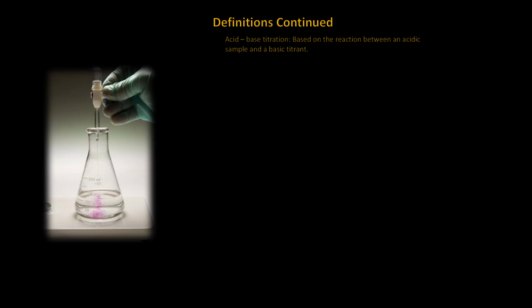In a precipitative titration, the sample would react to form a sparingly soluble compound. A common use would be to determine the concentration of silver nitrate solution. The sample could be titrated with ammonium chloride. At equilibrium, a non-soluble precipitate of silver chloride would form. The silver chloride would react with the indicator to indicate the endpoint of the titration.